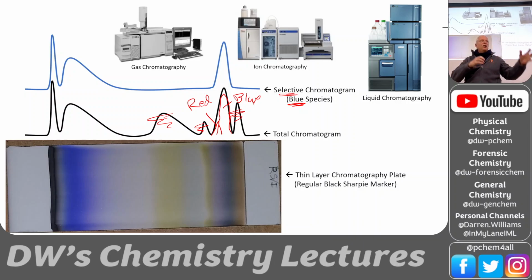But solvent programming is a great way to get liquid chromatography to fine tune the order and the speed at which the analytes come out. That right there, I'm telling you, is what analytical chemists do. They optimize these little programs to get better separation, narrow peaks, and fast analyses.